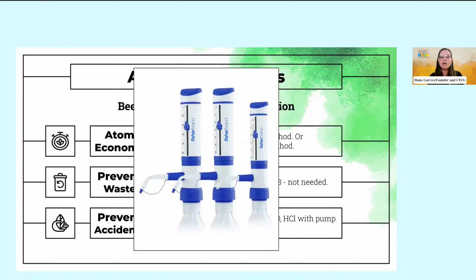I think any time that we can reduce volatiles being in an open bottle is something that's going to help protect people. And then if you don't have a hood to run your IBUs, please wear a mask to just sort of reduce your exposure.